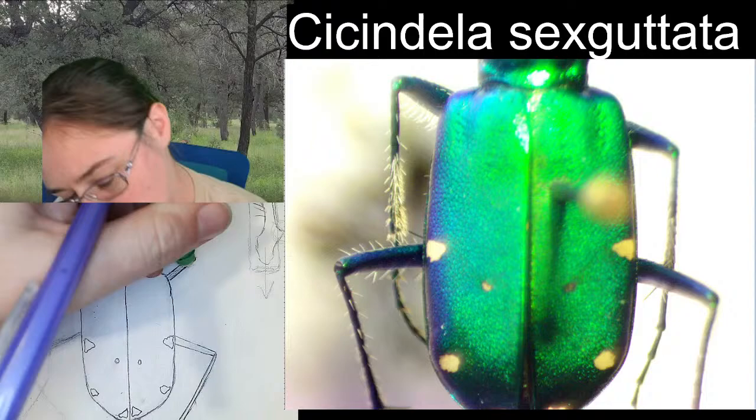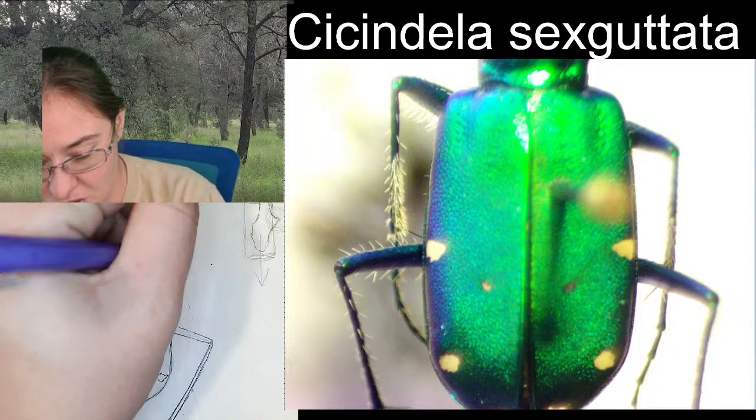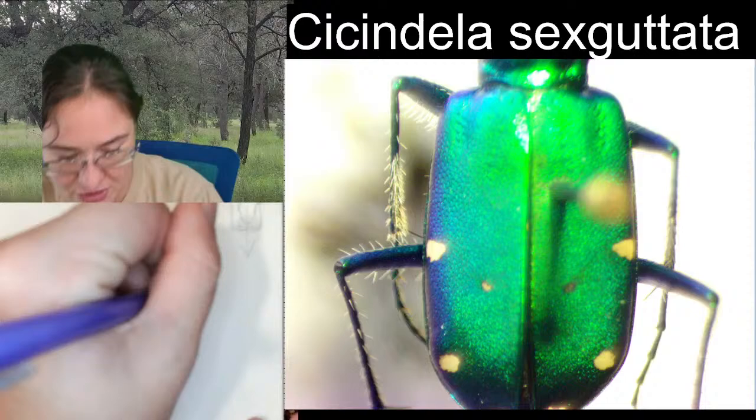My cursorial leg. And then the tibia is going to be coming down, and it looks like it's going to be the length of right above this first spot. So when it comes down, it looks like it's going to come down about like here, and then it also has two tibial spurs, but you're only going to be able to see one because of where it is. And then we've got those five tarsal segments, and I'm going to have them coming out in this direction. Also, keep in mind that they are going underneath the hind leg.